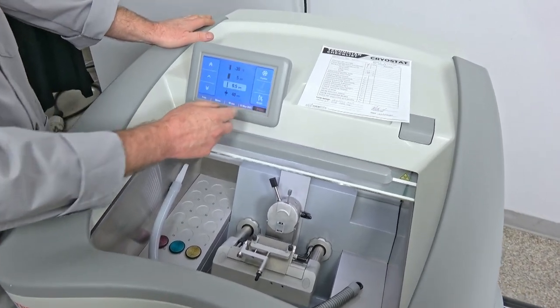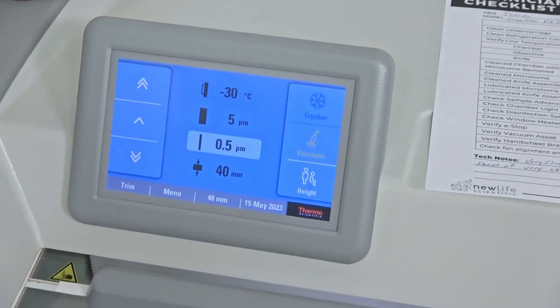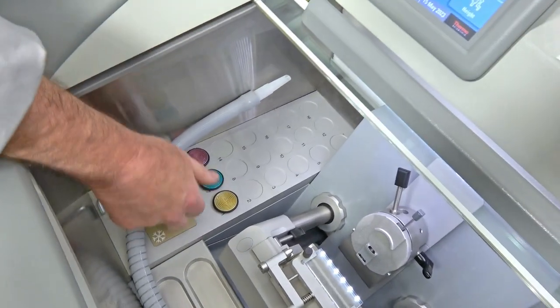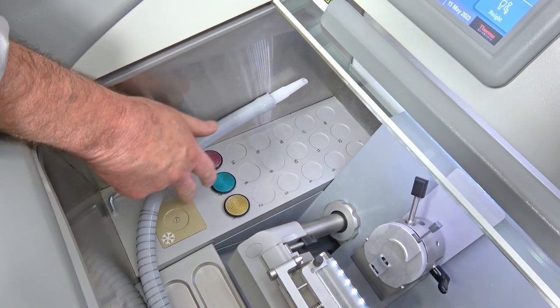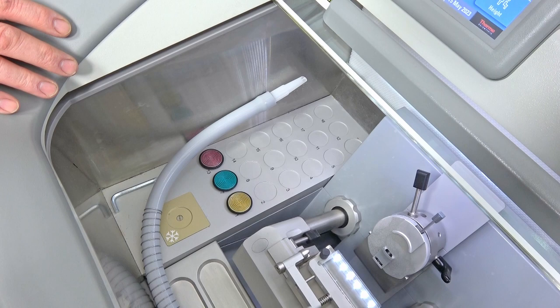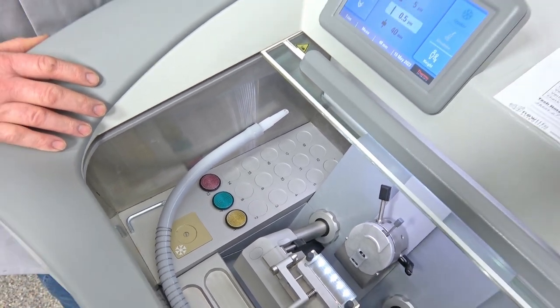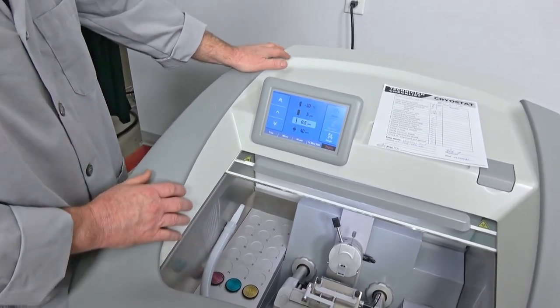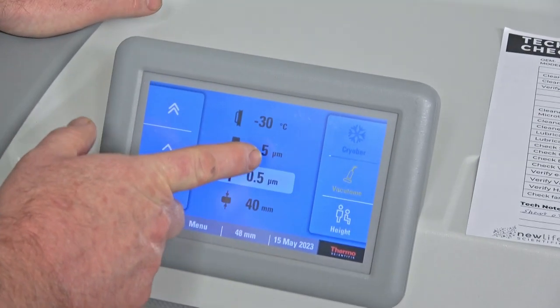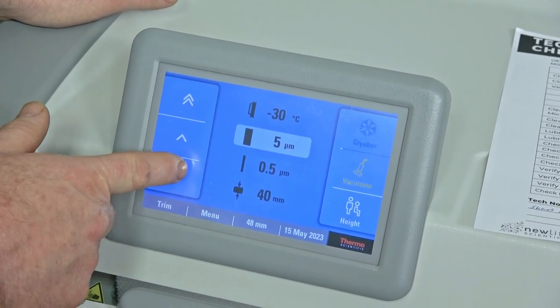Going back to the cold bar — you can just hit that and you get some really cold temperatures. You have a thermal couple on this that drops temperatures down to about negative 45 to negative 47, giving you a really quick freeze. And then of course you have your cutting distance controls here that you can move up and down.